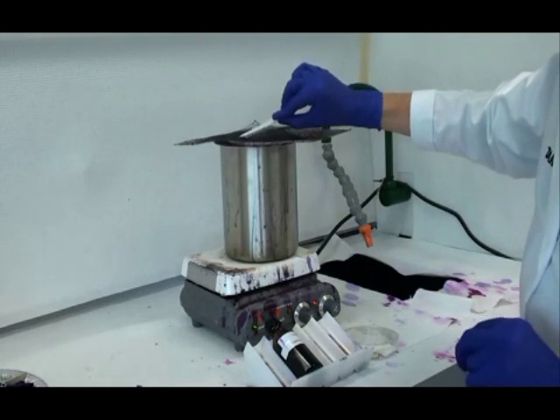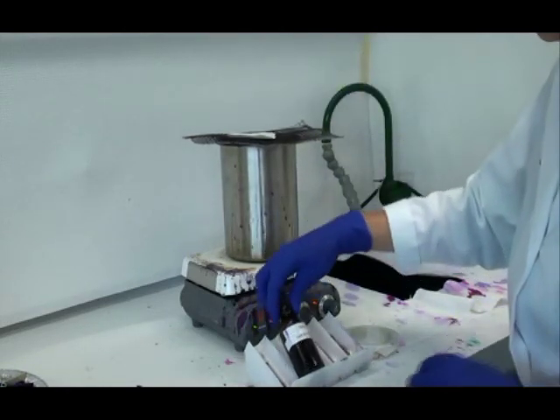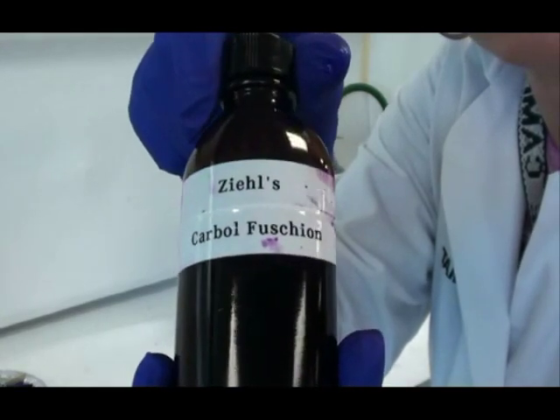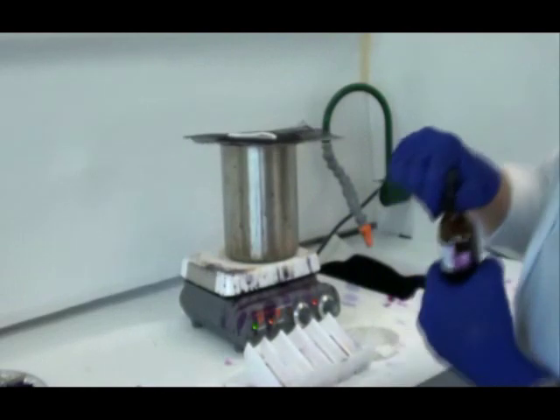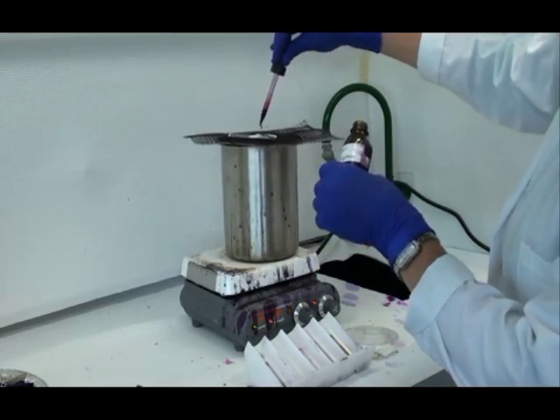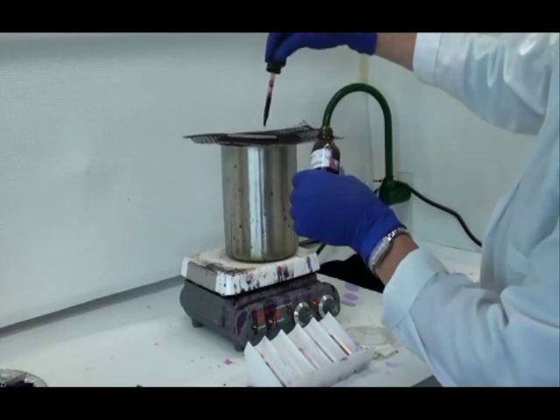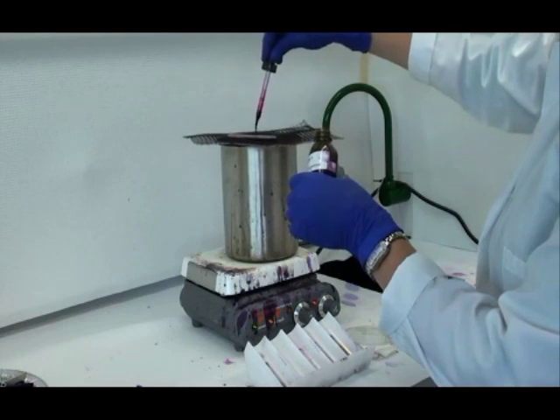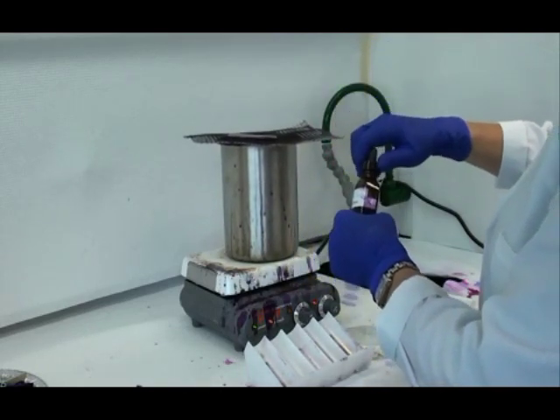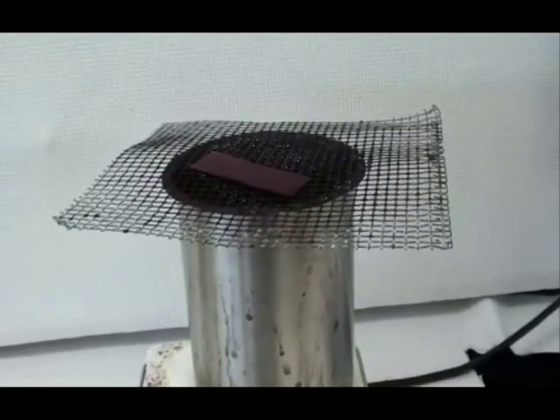I then place that slide with the blotting paper on top of my water bath. Now I'm ready to apply my primary stain, Carbolfuchsin. I drip the primary stain onto the slide — I want to totally saturate the blotting paper. It's okay if a little stain runs over and goes into the water bath, but I need that paper completely saturated. Now I'll let that slide heat over the water bath for three to five minutes. If the blotting paper begins to dry out, reapply more stain.